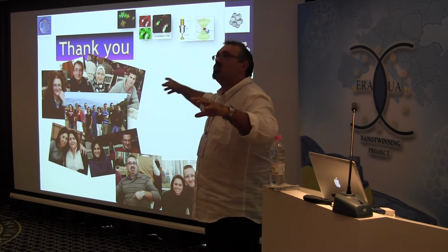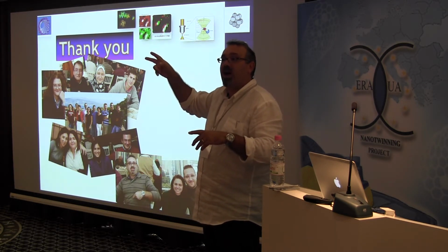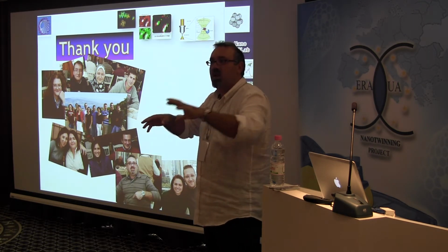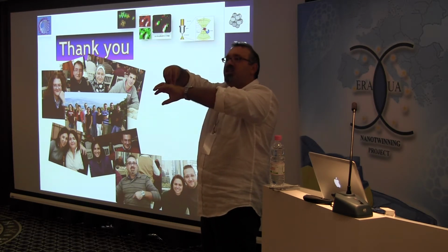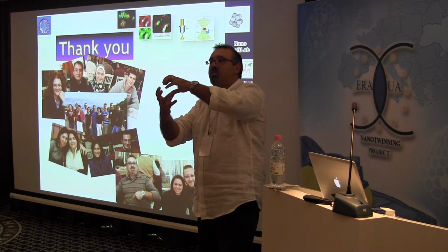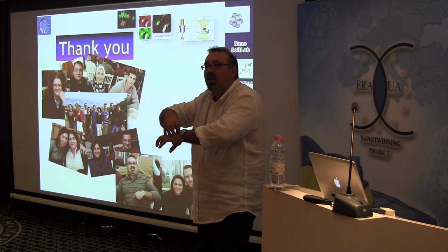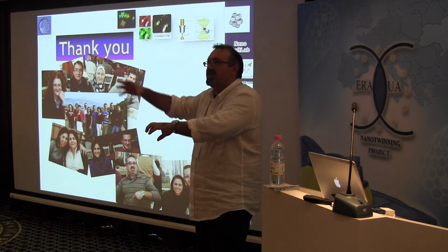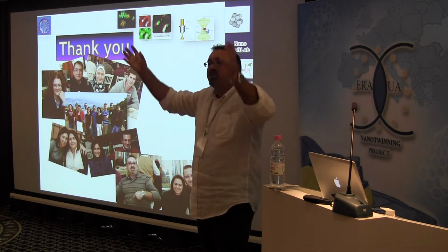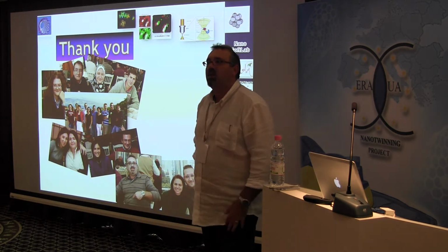In our case, we were blue shifted with respect to the LSPR, and this is a condition that is known to give rise to repulsive forces. So the nanoparticle passes the spot, receives the photons, receives the momentum, and goes down. When the nanoparticle is coated with this protein, it goes toward the glass, and toward the glass there is a sort of sticking. So the first nanoparticle sticks to glass, the second nanoparticle to glass and to the nanoparticle. So you create this aggregate by means of this optical force and this sticking phenomenon. And when you have an aggregate, you have strong SERS.